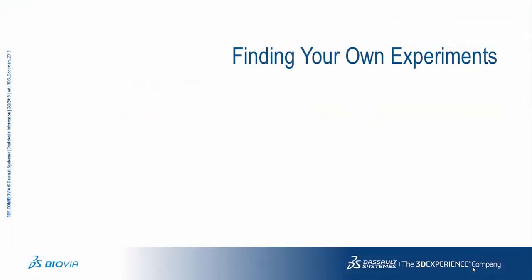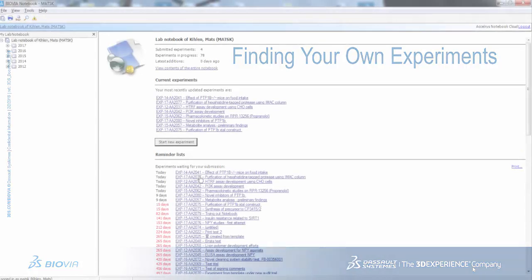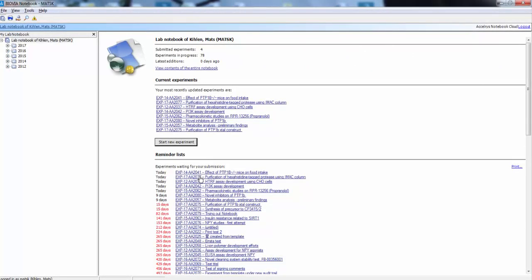The navigation of your own experiments and of other people's experiments is done differently. In the Windows client, you have your own book and you can navigate in a folder structure among different projects.